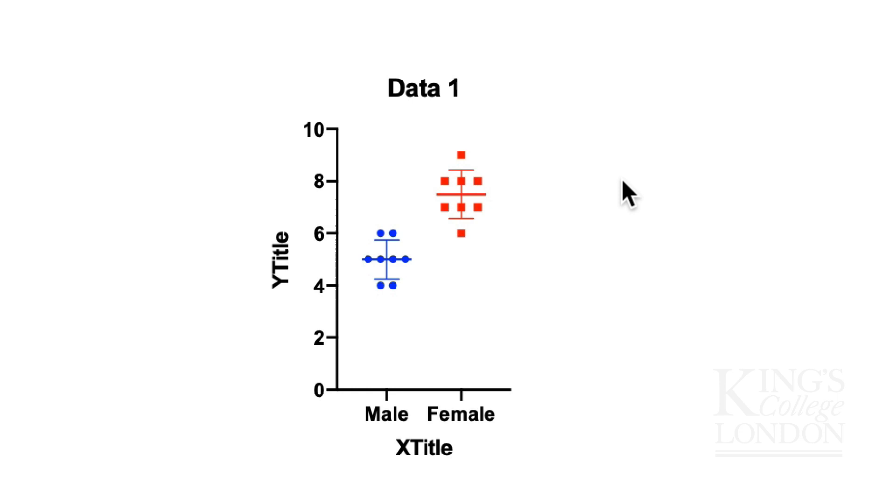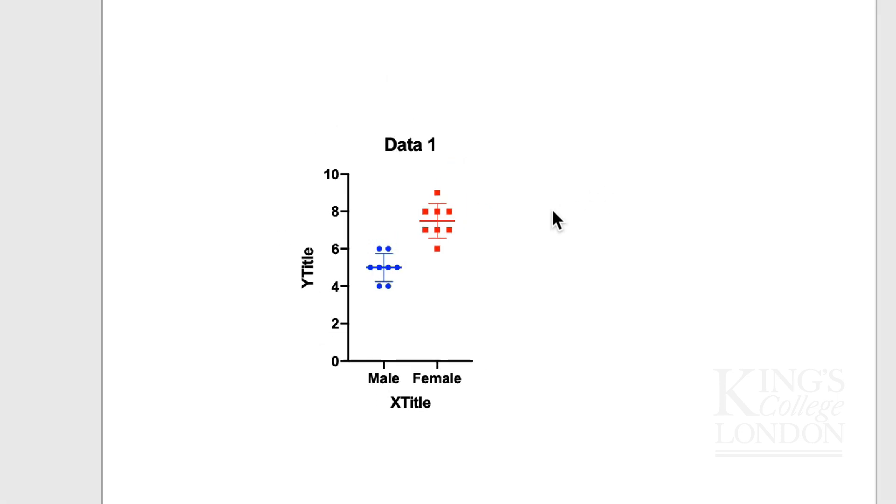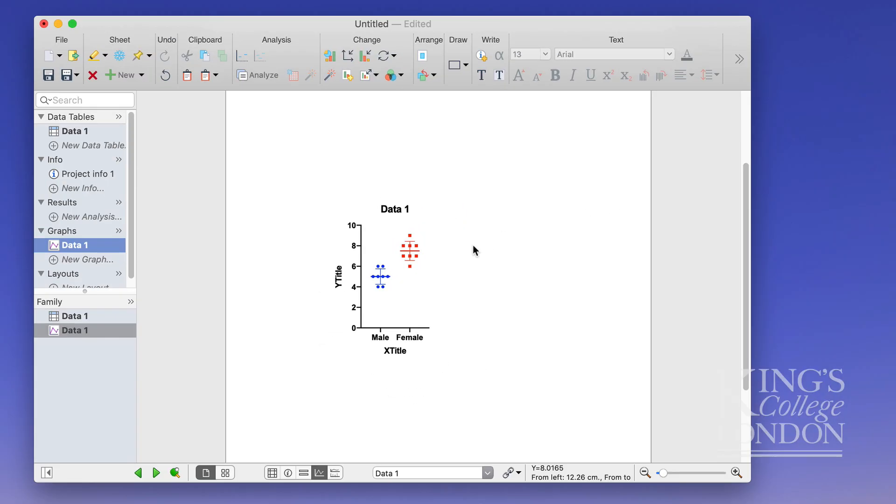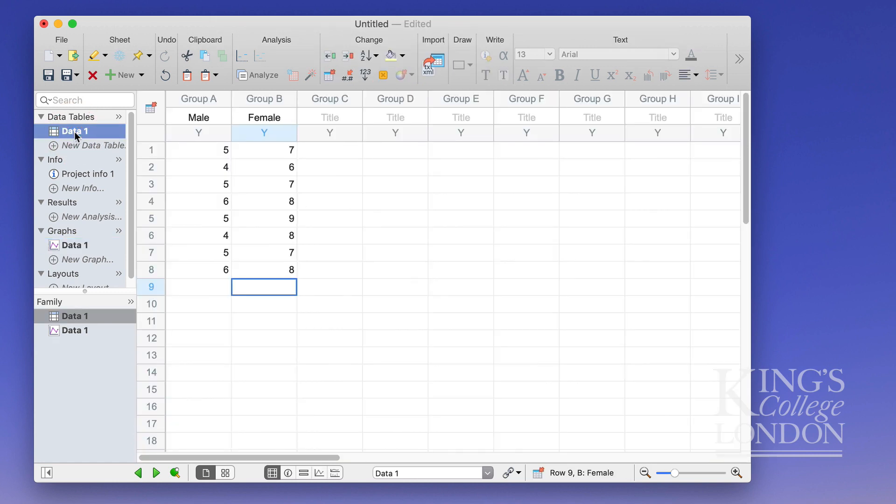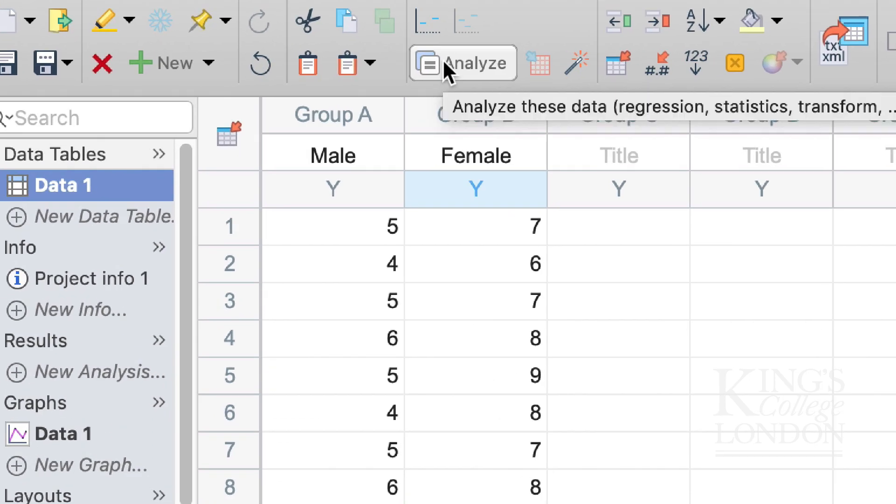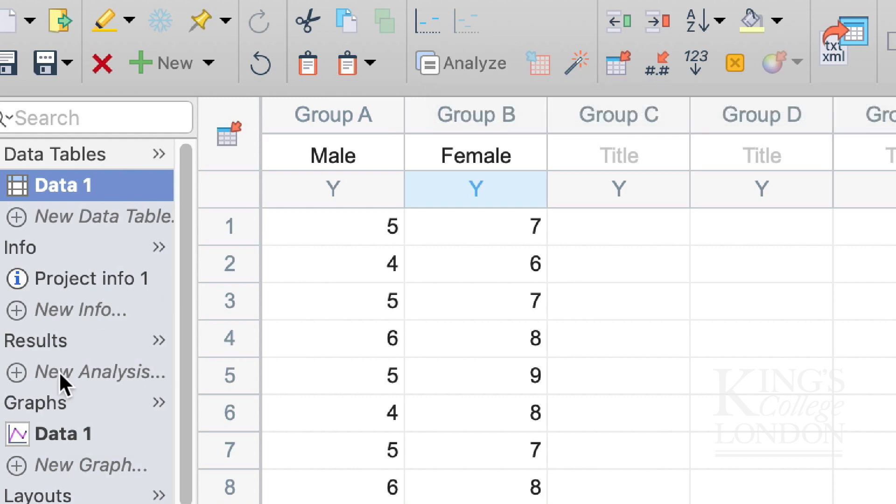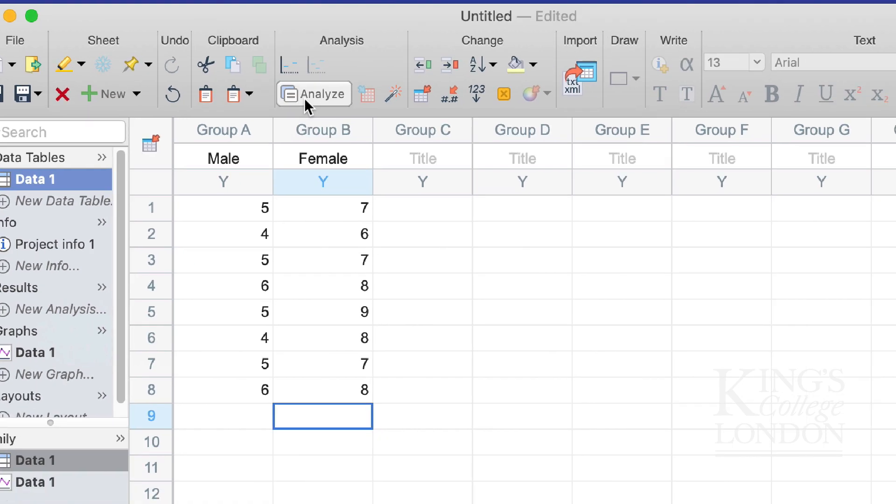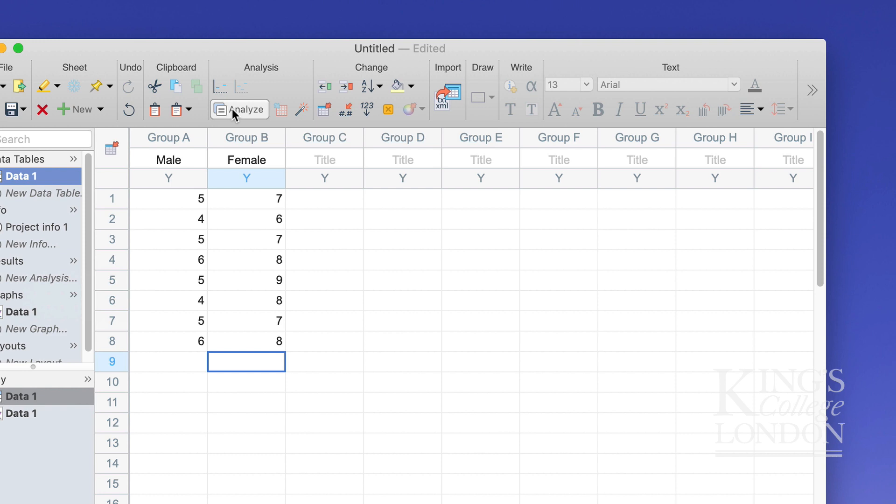So to do a student t-test on this data set it is very simple. The simplest way of doing it is going to the data table viewing the data and clicking on the analyze button. You could also click on the analyze button in the graph table or click on new analysis in the results table but for this example we'll click on analyze in the analysis bar.